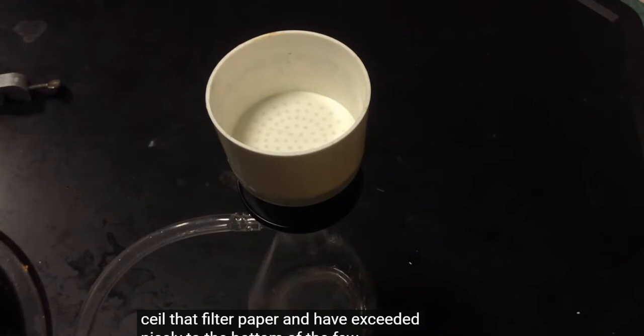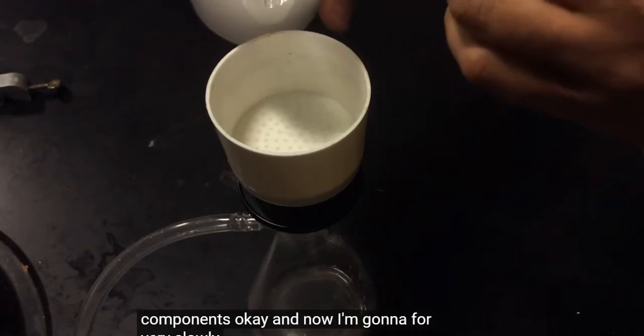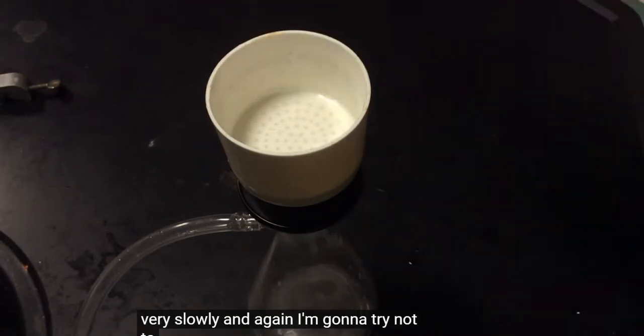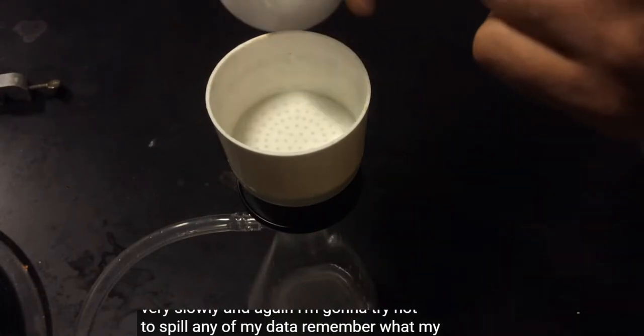Okay, now I'm going to pour very slowly. Again, I'm trying not to spill any of my data. Remember, all my data is in the what? Is in the precipitate.